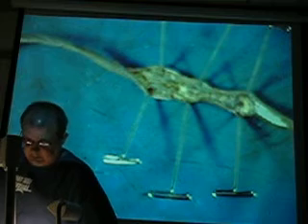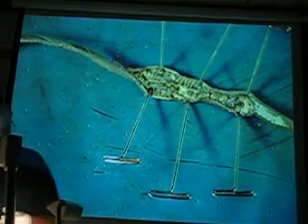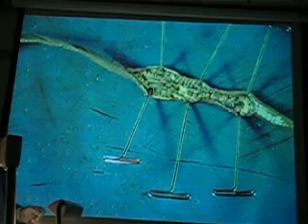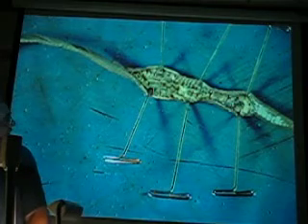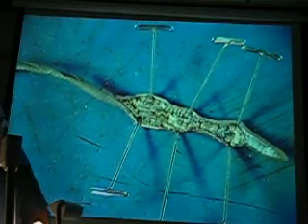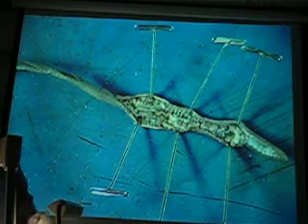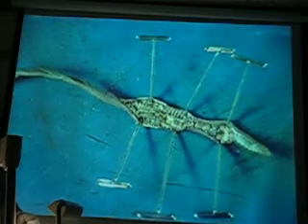We've got a couple of structures. Oh. That looks pretty funny. Is it kind of in focus? It's still moving. It's kind of funny. If I center that a little bit better. It's having a hard time with the depth of field. So let's zoom out just a wee bit here.